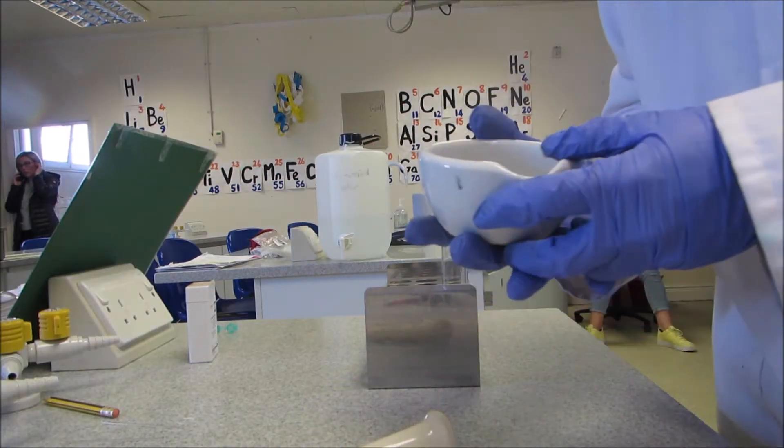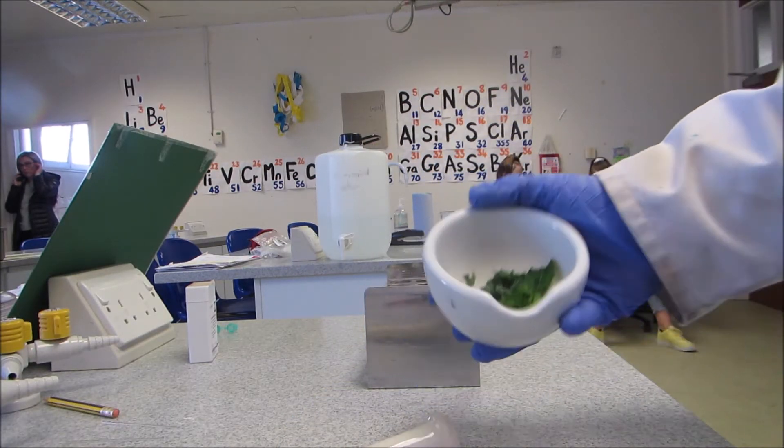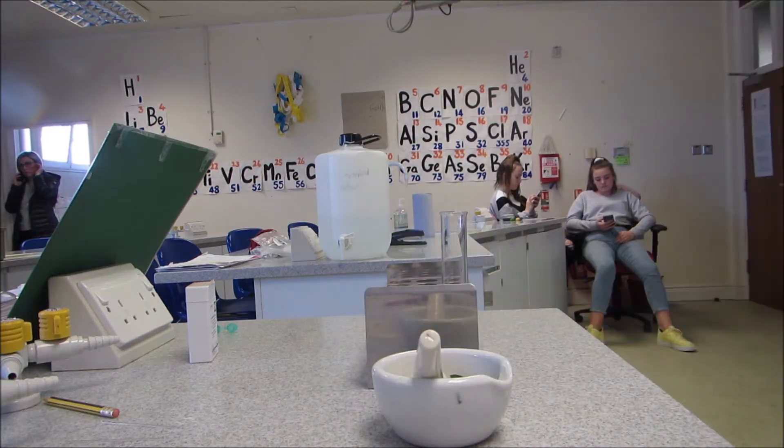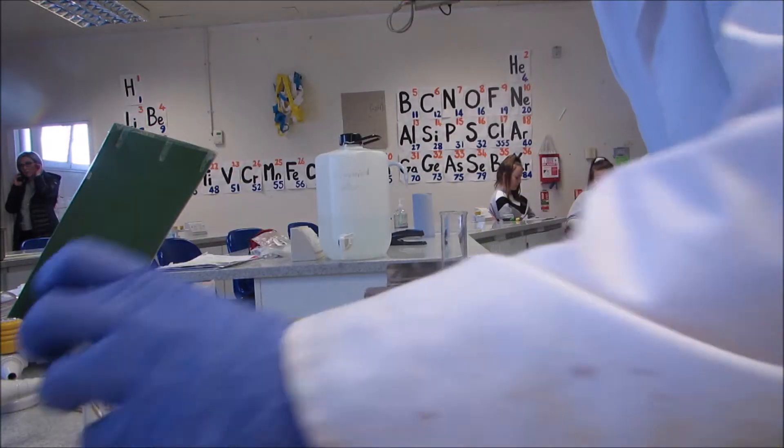Okay, so to extract the chlorophyll from spinach leaves, I've cut two grams of spinach and put it in there. And then I'm going to add three milliliters of acetone, so that's my three milliliters of acetone.